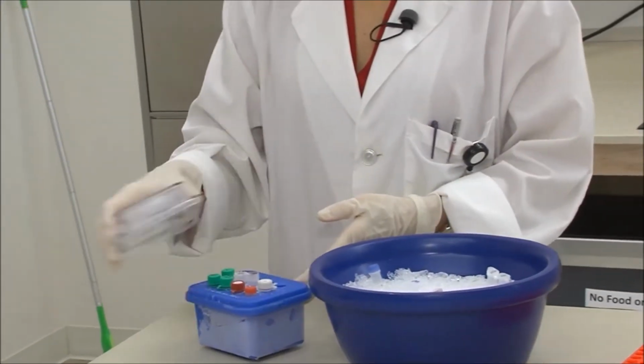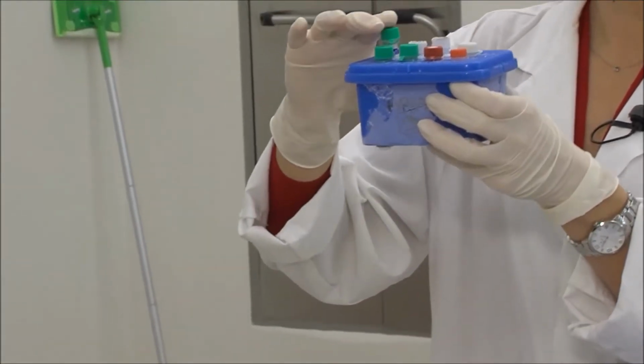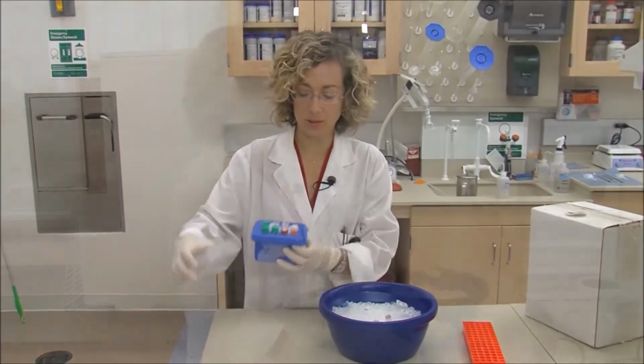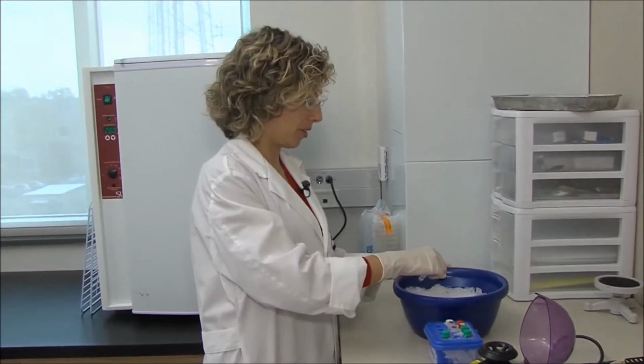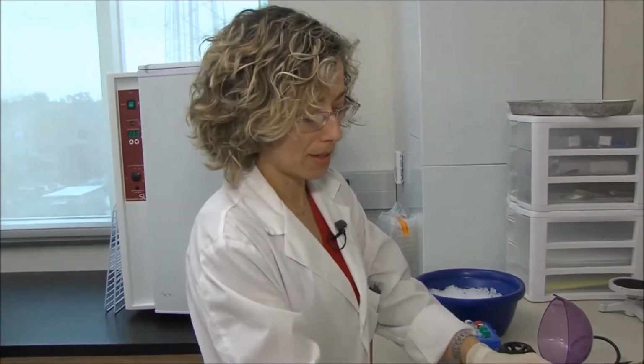Finally, we need our Taq polymerase that we are going to maintain in this ice block, and the reason why is because we don't want to have it above minus 20 degrees Celsius. It is important when you work with small volumes like we do when we are setting up a PCR reaction to make sure that your reagents are well mixed, and for that we're going to vortex them for a few seconds.